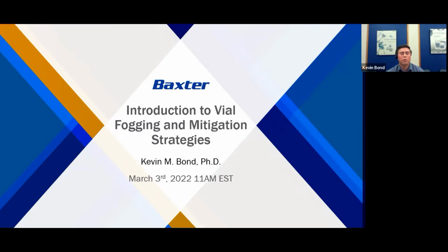Additionally, our group is also part of a lyophilization consortium called LyoHub, where members from academia and industry work together to advance freeze drying, as lyophilization is one of our group's specialties as well. So part of our research and development efforts in our group have been focused on vial fogging, which is of course the topic for my webinar today.